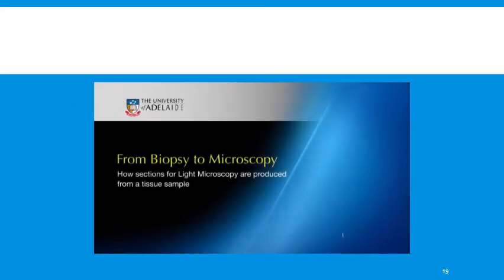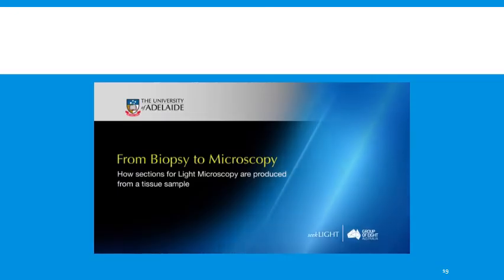This video shows preparation of the microscopical sections for the light microscope.